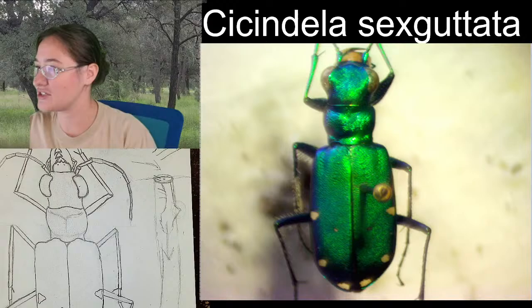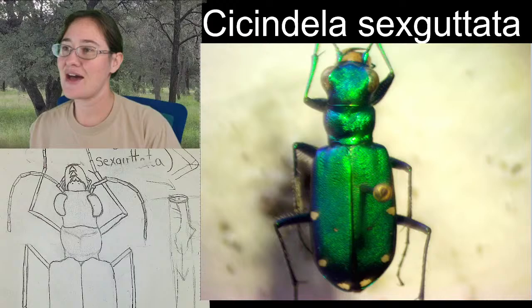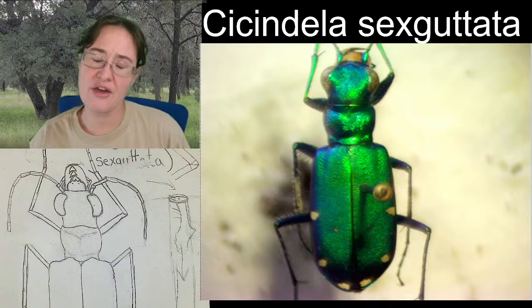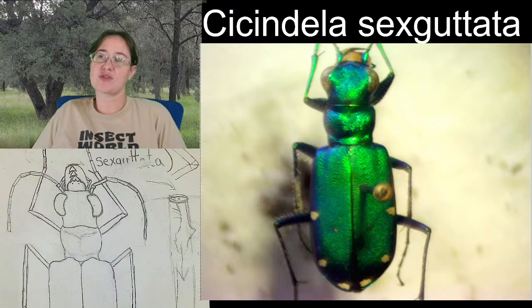Oh, good! I'm glad I explained everything well. I think that I really do love our tiger beetles. That's fun. Cicindela is the genus of our friend here, and was the first genus of tiger beetles described. I'm not sure. I believe that there are other genera of tiger beetles out there, but Cicindela are the first ones, and I think they're also the largest group of tiger beetles. And their whole subfamily is based off of their name. So Cicindela is the genus, and Cicindelinae is the subfamily.